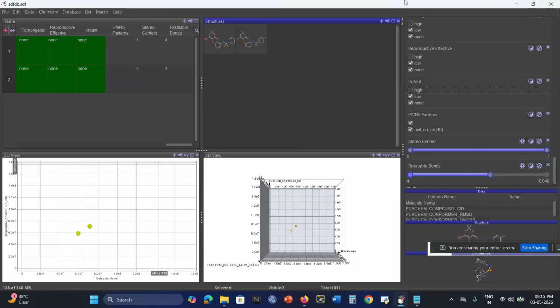Okay, so this is known as QSAR screening. On the basis of a quantitative structure activity relationship, we have already developed this particular group of compounds based on the already available drugs.